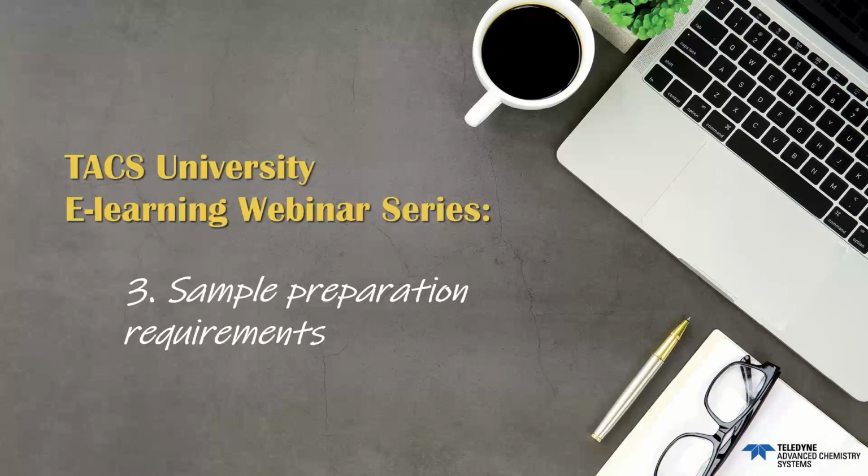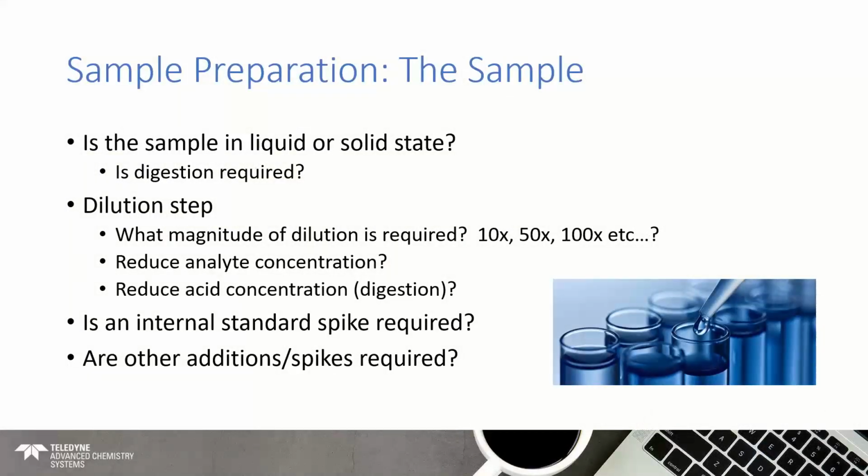So, sample preparation requirements. What do we need for this? I've already alluded to some of this. Our samples are received. What state are they in? Are these samples already in a liquid state, or are they in a solid state? If they're liquid, do they have a high level of total dissolved solids, for example? Do they have debris in them? Do they need filtering? Do they need digestion? That's the first question.